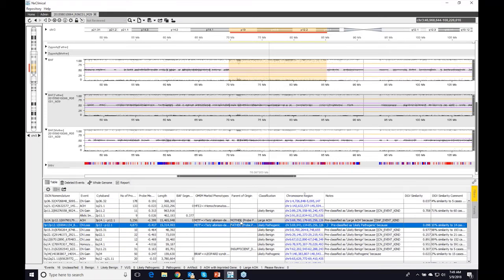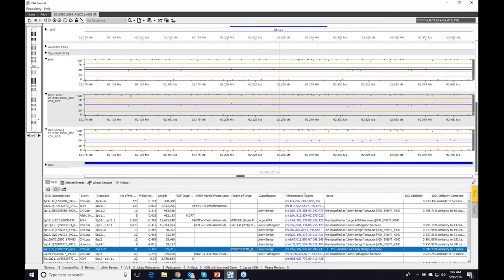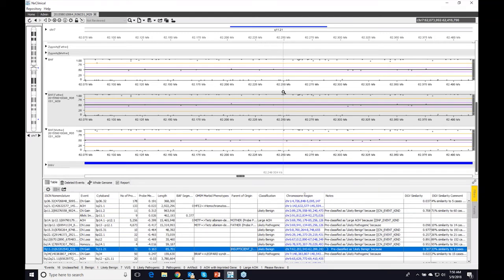For a small gain with only 31 probes, it shows 'insufficient data' because there aren't enough informative SNP probes to assign a parent of origin. This feature has had many requests, and hopefully users will find it useful.